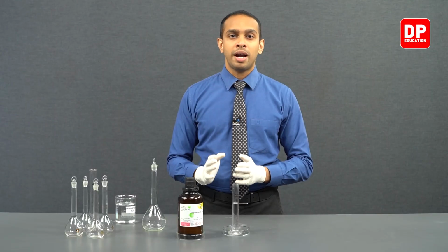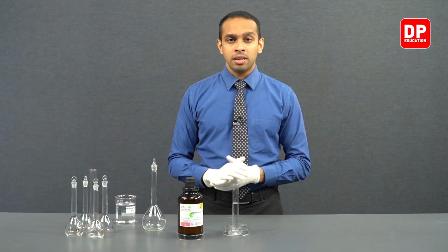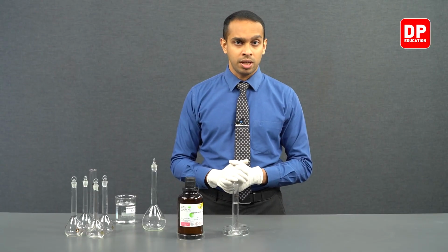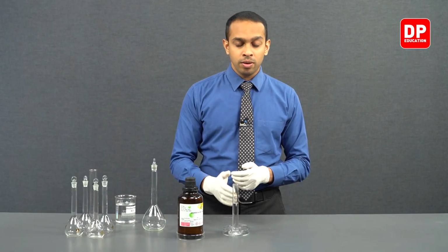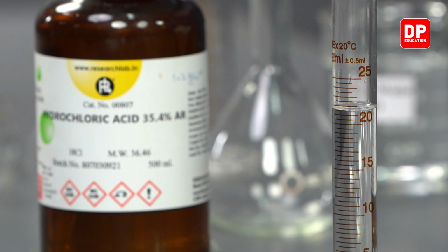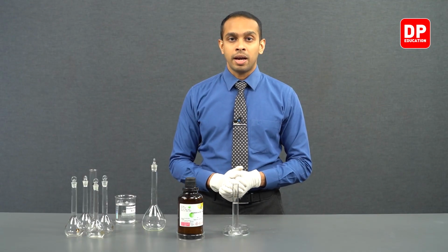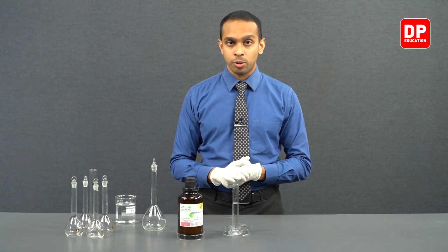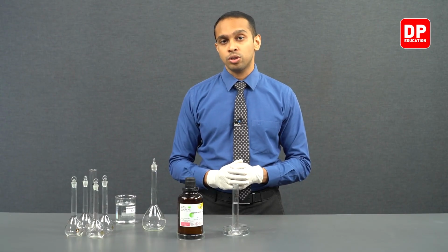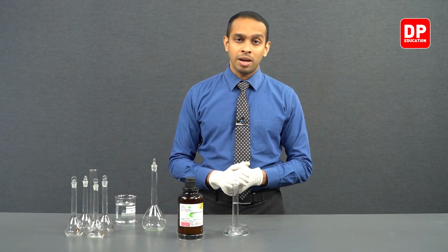Students, as you know, hydrochloric acid is an extremely strong acid, and it is going to be very corrosive if it comes into contact with your skin. So we have already measured 21.5 cubic centimeters of hydrochloric acid, as you can see over here. And even in the lab, when you are handling hydrochloric acid, please be careful, especially at high concentrations. It could be quite dangerous to handle.